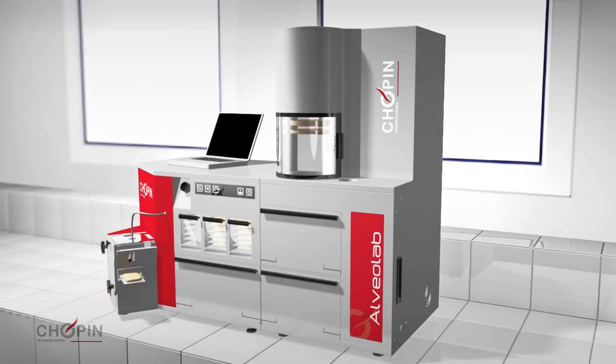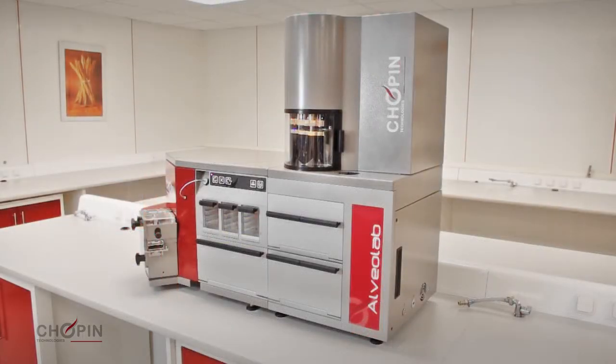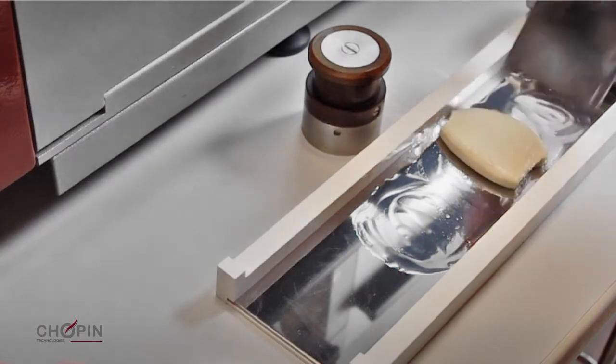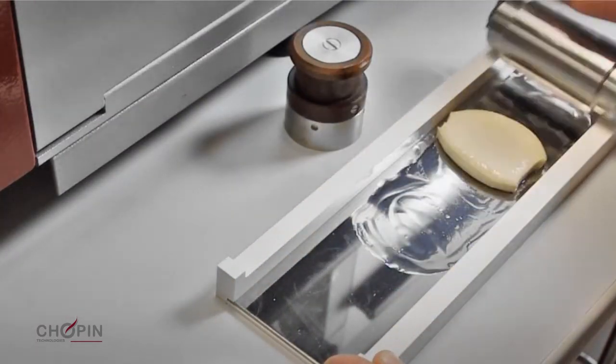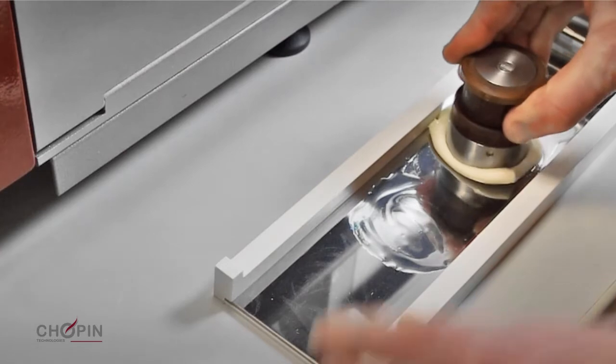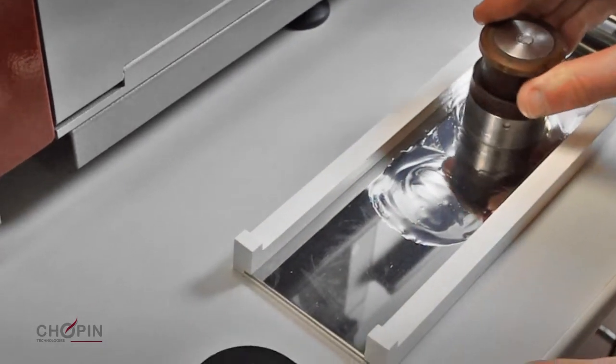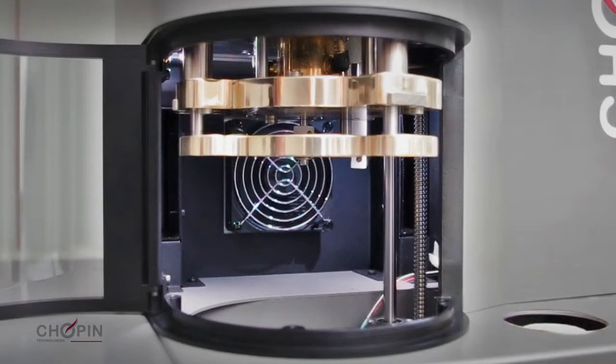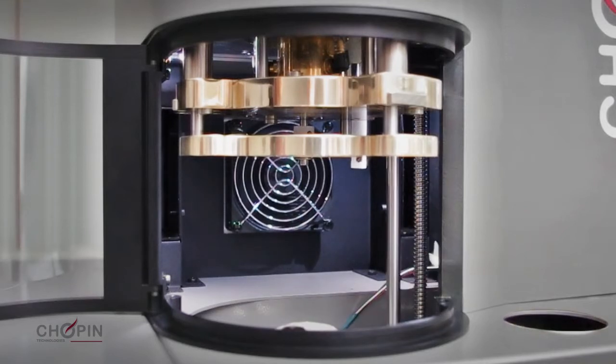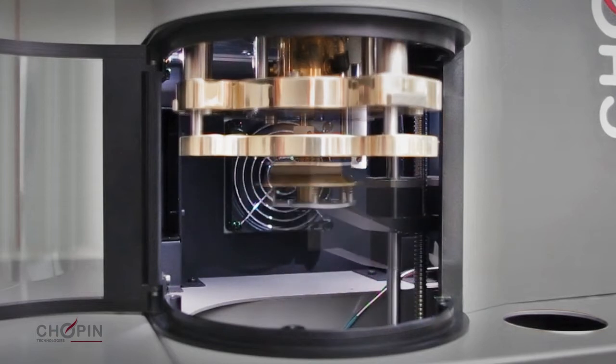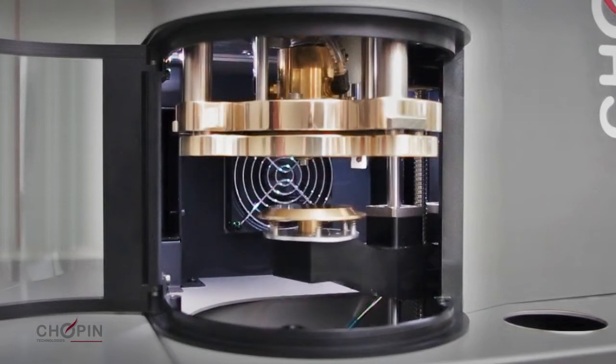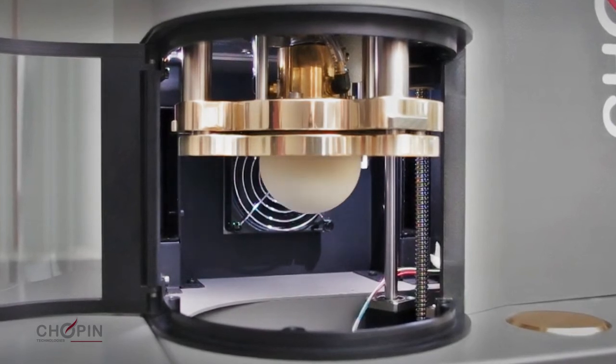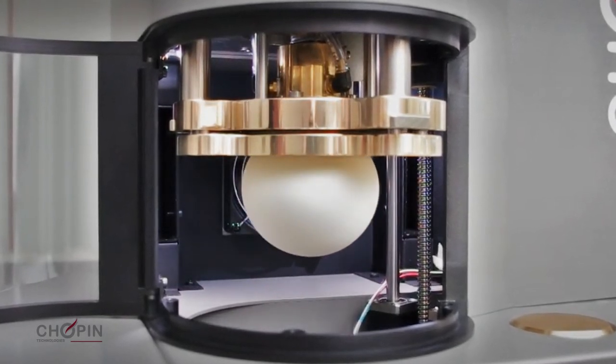Some examples of these innovations are automatic pump calibration, automatic water injection, new accessories such as resting plates and a dough cutter to better control the preparation of dough pieces, automatic positioning and swelling of dough pieces in a humidity and temperature controlled compartment, and the inverted bubble which is more spherical and closer to the ideal test conditions.